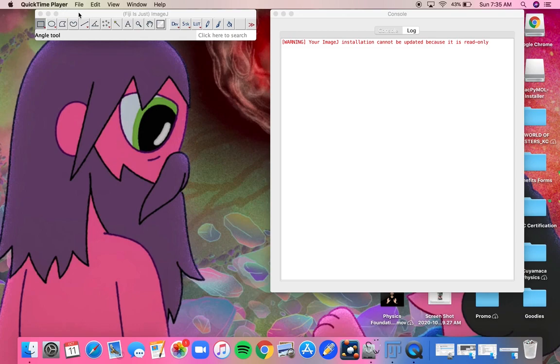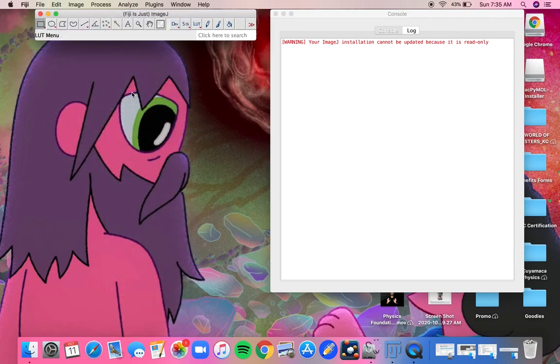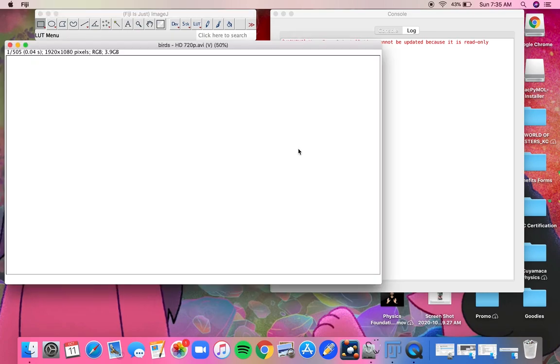All right, so go to Fiji, open it up on your computer. Hopefully, most of you still have it. If you don't, there's a link to download it in the original lab that we use Fiji in. I think it was week 3. And so you can go here to File, Import AVI, and you want to go to Canvas and download the birds video. As long as that's downloaded, you can just go to your downloads and then click your birds, and then click Open, and then click OK.